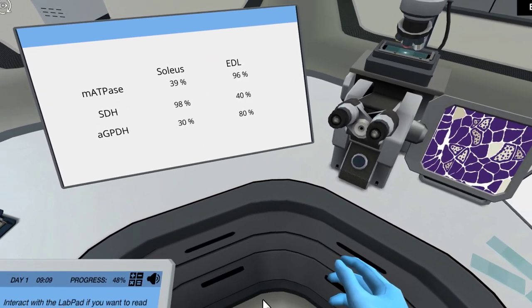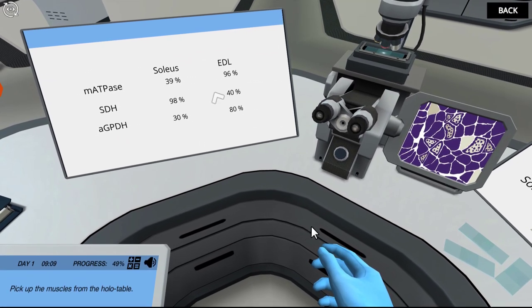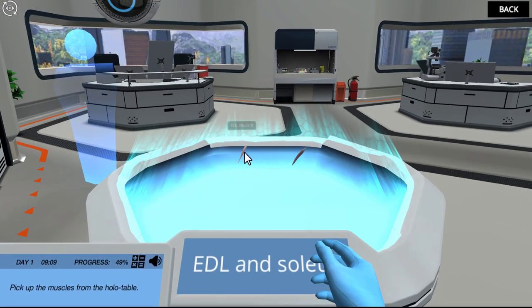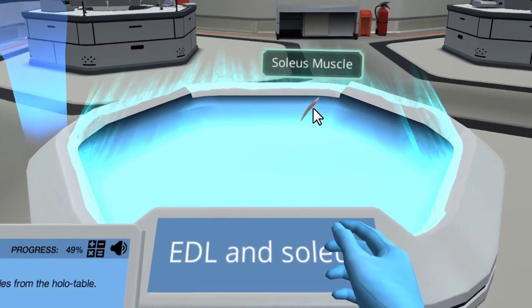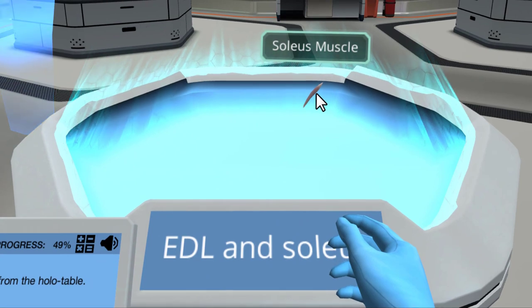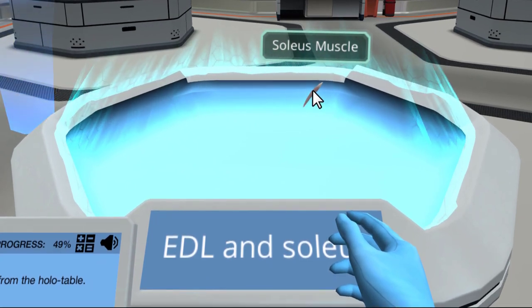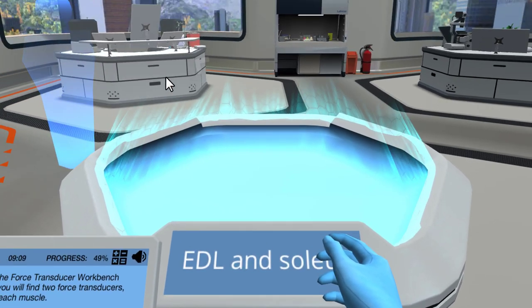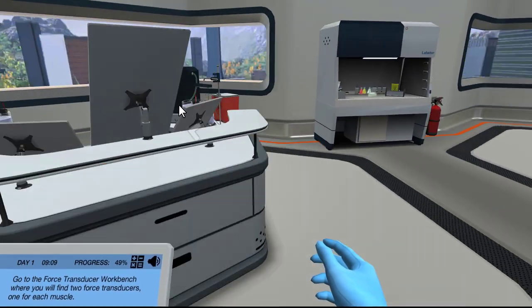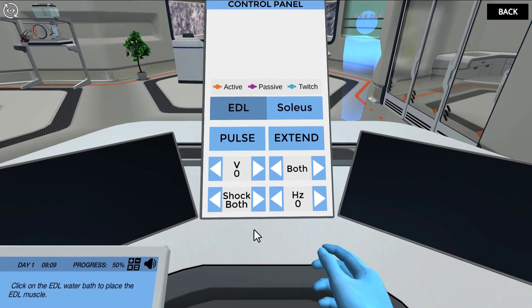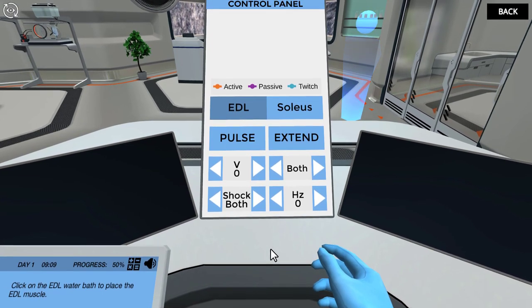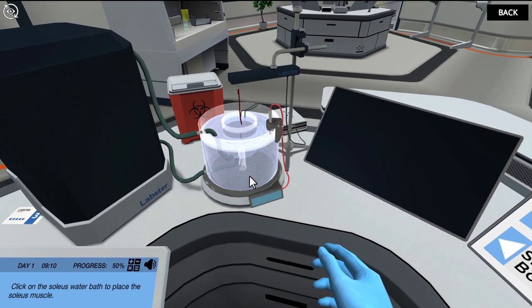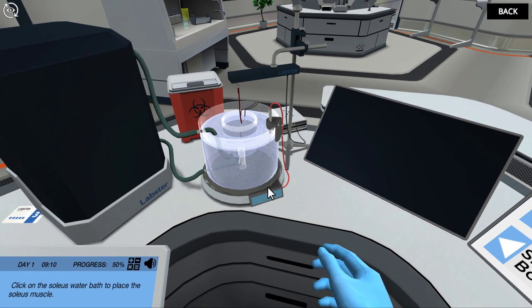It is time to test the responses of the muscles to different stimuli. First, you need a new set of muscles. You have collected a new fast twitch EDL muscle. Now collect the slow twitch soleus muscle. Now that you have both muscles, it is time to attach these to a force transducer. Go to the force transducer. Click on the EDL water bath to place the EDL muscle. Click on the soleus water bath to place the soleus muscle.